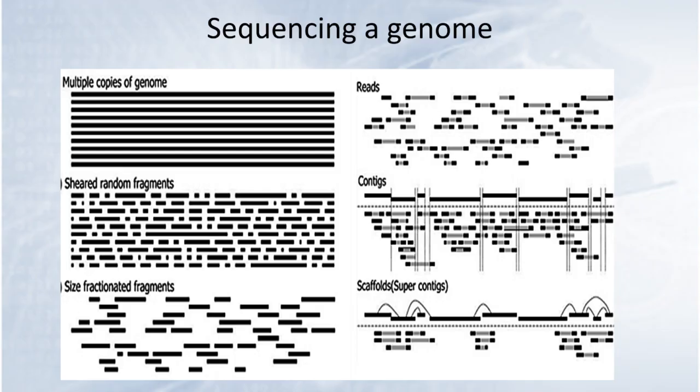So looking at this sort of schematically, when we start the sequencing project for each of your genomes, your bacterial genomes that you're sequencing, you're really starting out with a solution that contains many, many copies of your genome in a relatively intact form, long stretches of chromosome, but many, many copies of that. And those are, in one way or another, randomly fragmented.